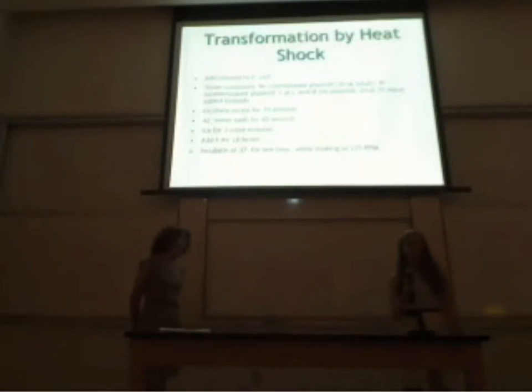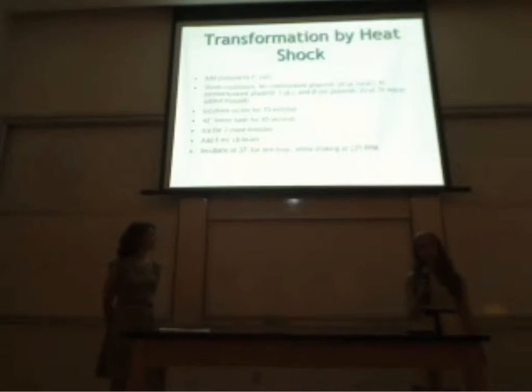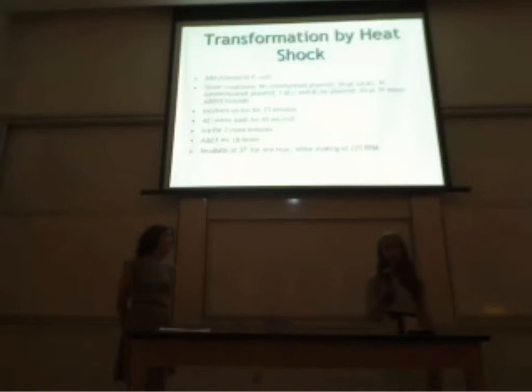After we methylated the plasmid, we decided that we wanted to have 3 different types of bacteria. We wanted a control group with no plasmid in it, another group with a plasmid that was not methylated, and a third group with a methylated plasmid in it. To transform the plasmids into the E. coli, we heat shock them.